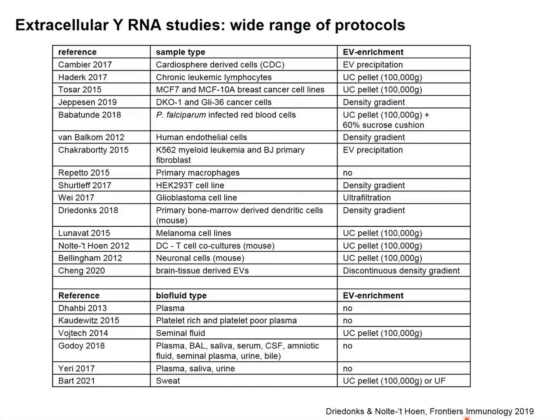We have shown before that there are many studies that detected extracellular Y-RNA in a wide range of biological samples. It is also clear that there is a wide variety of protocols that are used to enrich for extracellular Y-RNA. You can see that in this table. Most of the studies used ultracentrifugation-based methods, which enrich both EVs and ribonuclear protein particles. Some of the biofluid studies isolated RNA from the total biofluids. So while these methods will give you RNA to work with, they may not tell you what extracellular RNA carrier the RNA of interest is associated to.